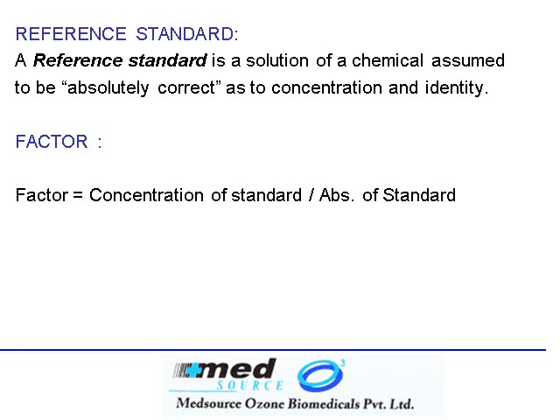Now if we take an unknown solution and we check it and we see an absorbance of 0.5, then we know that 0.5 always corresponds to 5 drops of ink. If we get an absorbance of 1.5, then we know that because 0.5 absorbance means 5 drops, therefore 1.5 absorbance means 3 times of 5, or 15 drops. In this case, the fact that 0.5 was the first absorbance that you got with a known amount of 5 drops makes 5 drops a reference standard.